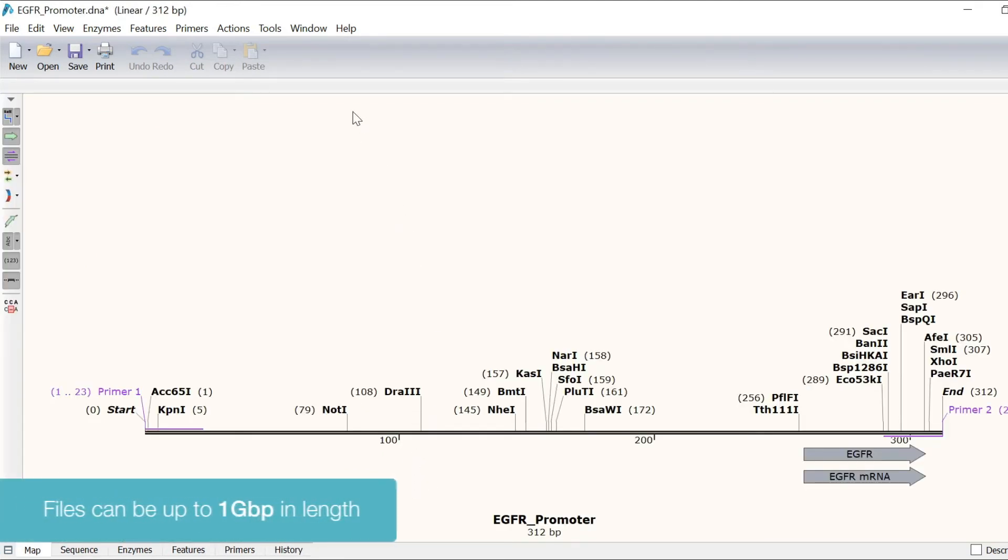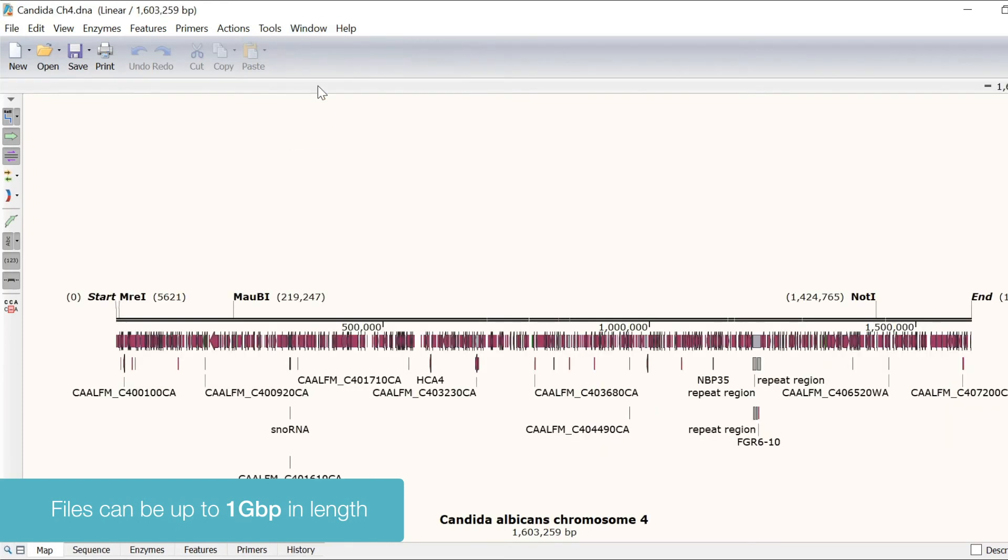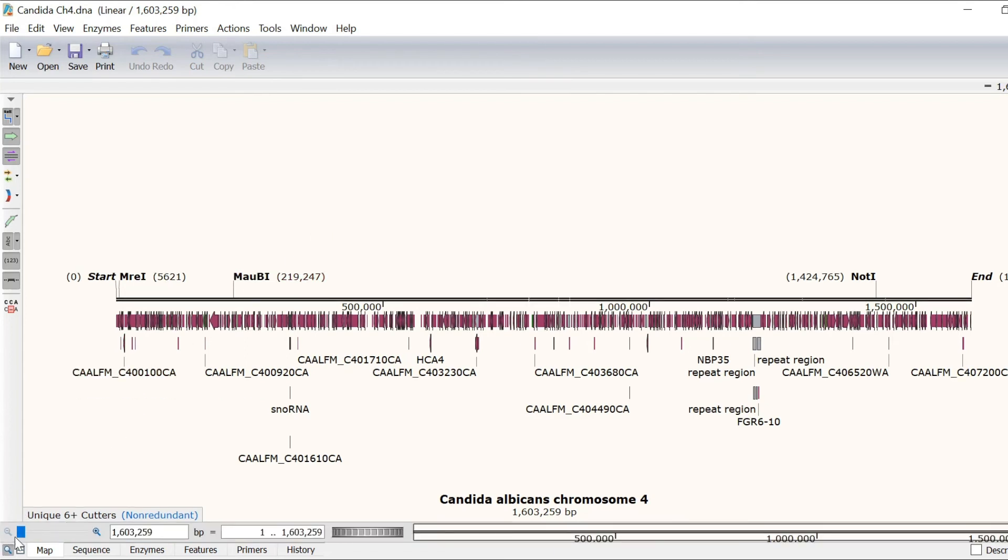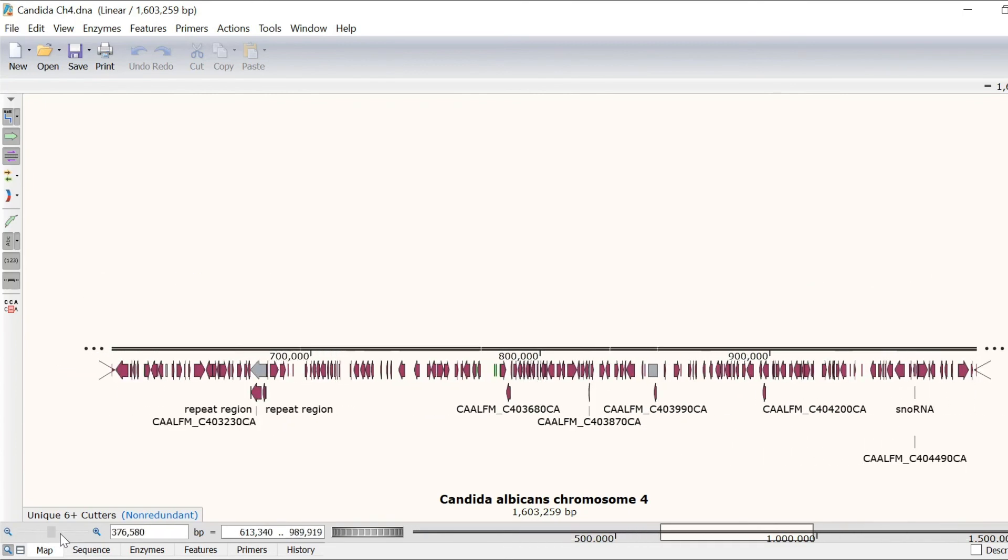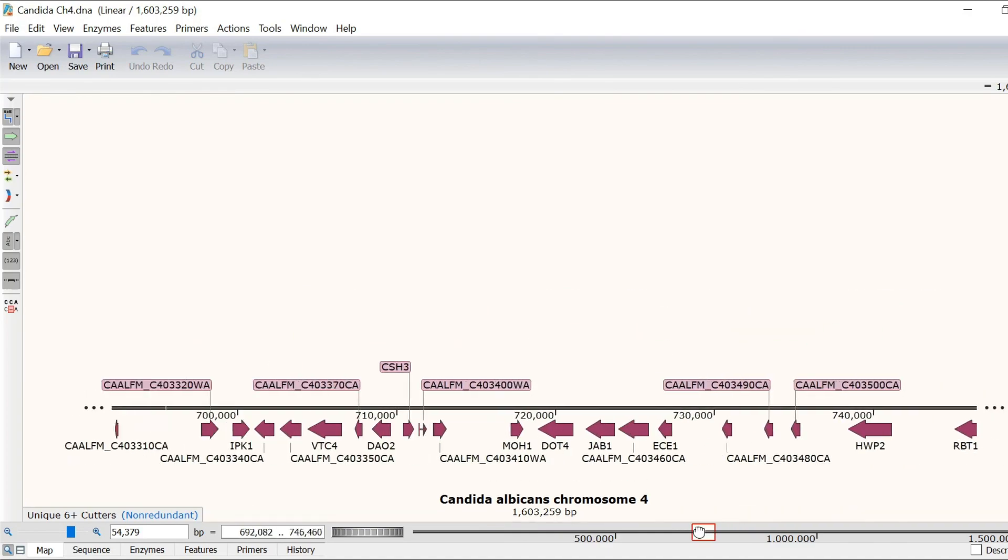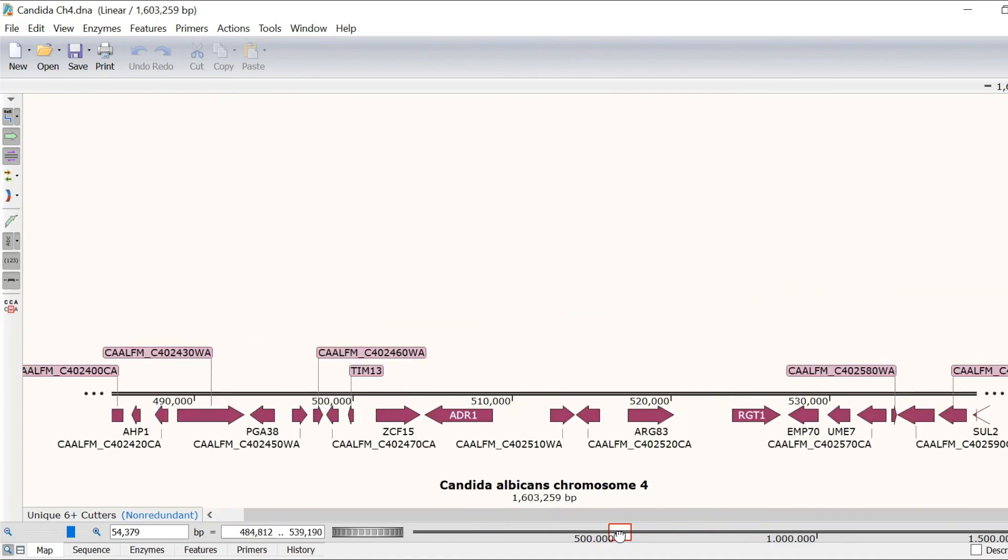Working with large sequencing files is also not a problem for Snapgene. Here I have the complete sequence of Candida albicans chromosome 4 open, which is 1.6 megabase pairs long. By clicking on the zoom controls option, you can easily adjust the zoom factor and sliding window display using the versatile controls to quickly navigate around the sequence.